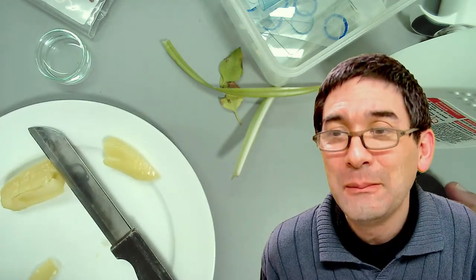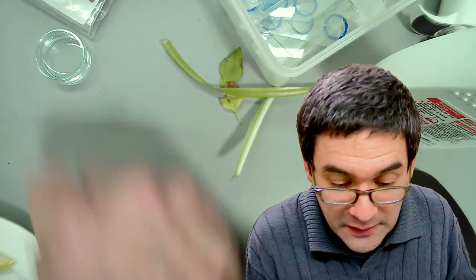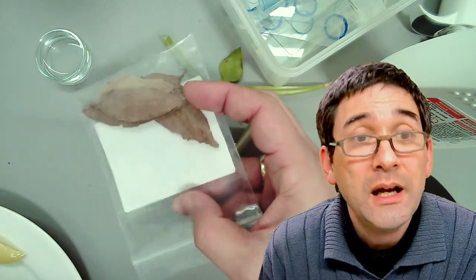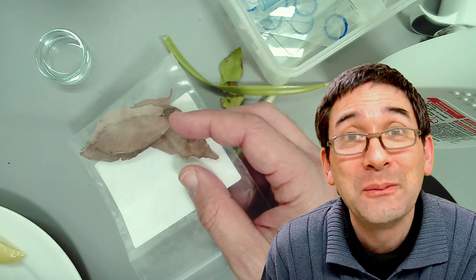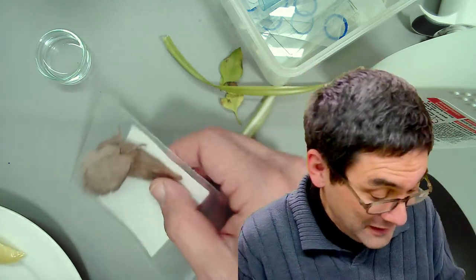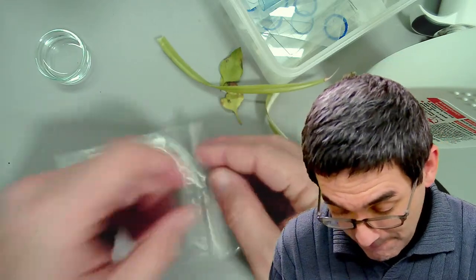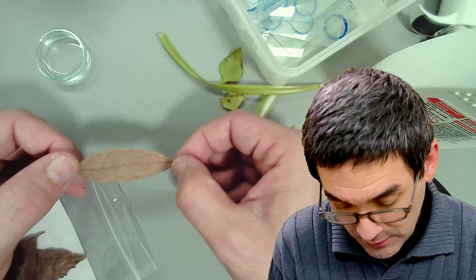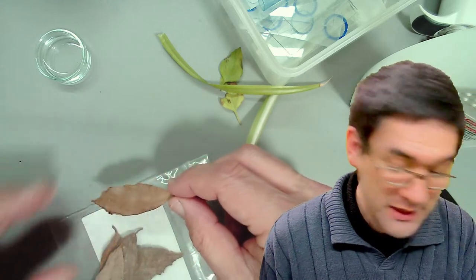I'm going to go back a little bit to the plant part here because I would like to show you something I kind of liked — some leaves here. I got to tell you a little bit of a story about where I got those leaves from. Somebody who was living in Thailand basically saw my YouTube channel and a couple of years ago sent me some of these leaves. I put them under the microscope and was able to find something quite nice. These leaves are a little bit different — I don't know which leaves they are, but they look very fuzzy on the bottom side.